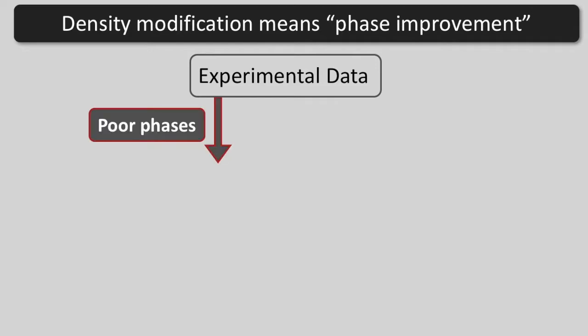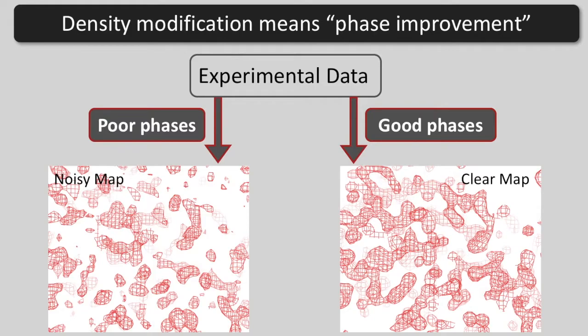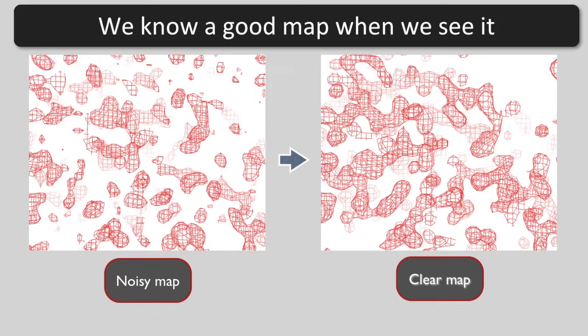With the same data, poor phases lead to a noisy map and good phases give a clear map. Density modification is improving the phases to obtain a clear map. Look at these two maps. The one on the left is noisy and the one on the right is clear. We can list things that are different in the clear map.